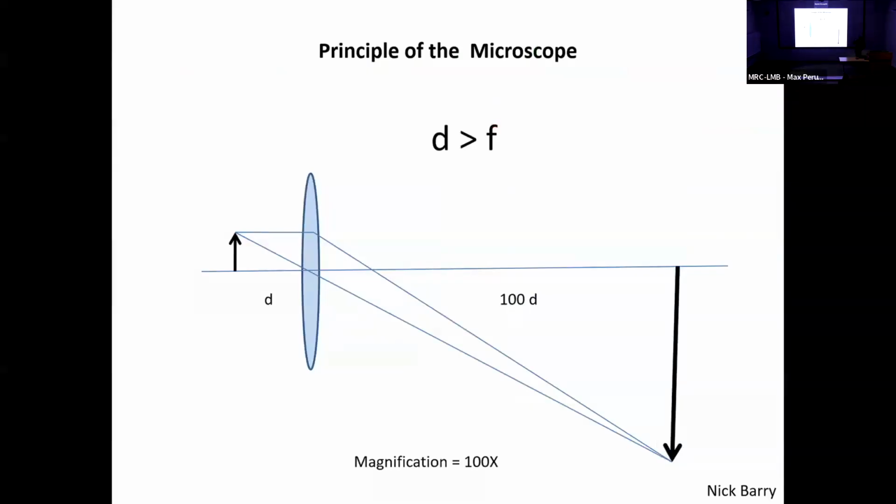As I alluded to just now, the magnification is really the ratio of the image distance to the object distance. It is very easy to get magnifications up in the 100x. In reverse, that's what's going on in your iPhone. This is you standing here, and the sensor in your phone is here. So it's working backwards compared to a microscope. We want to make things bigger.